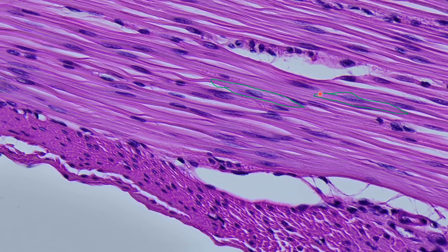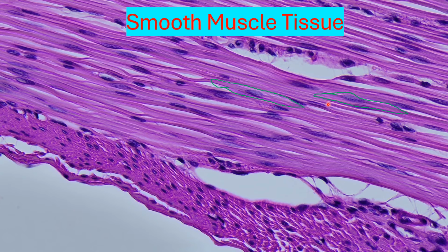We don't see any striations that are perpendicular to those, therefore we can tell this is smooth muscle tissue. Now another thing to note is that with smooth muscle tissue, it's involuntary, and oftentimes we'll see samples where we have longitudinal sections of the muscle tissue, and over here we have a cross section of that muscle tissue right there. So we have two different layers, but this is smooth muscle tissue.